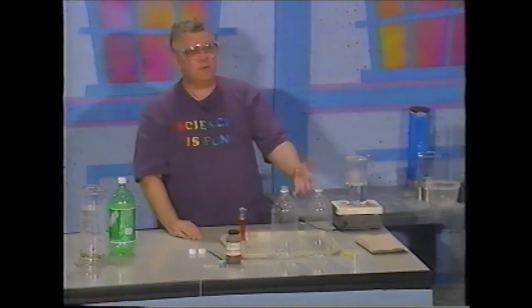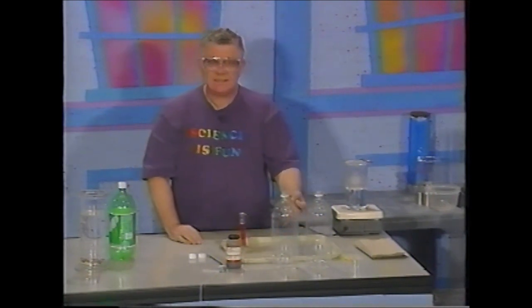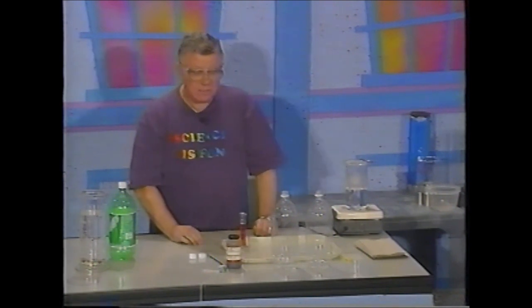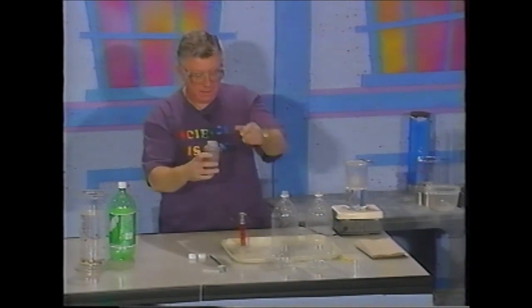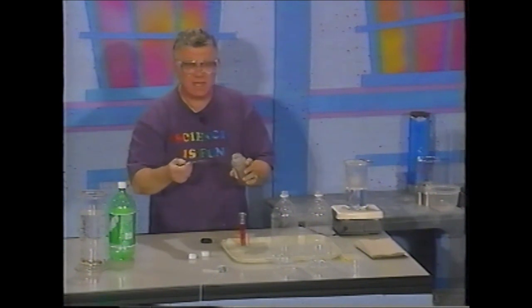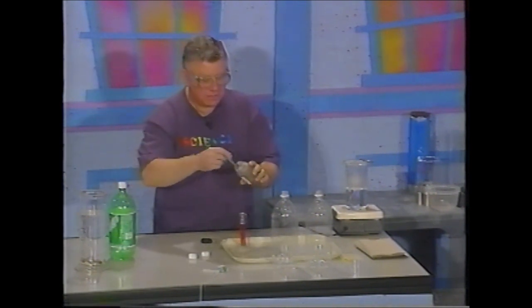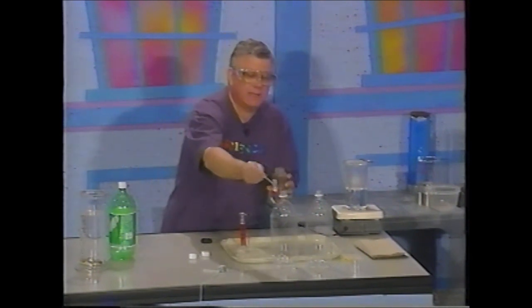It decomposes. When it decomposes, it turns into oxygen and water. In science, especially in chemistry, we study what catalysts can do to the rate of a reaction. And I have a powder in this bottle. I'm going to take a small amount of this powder and add it to the hydrogen peroxide to see if it has any effect on the rate of decomposition of the hydrogen peroxide. So I'll take some and simply add it.